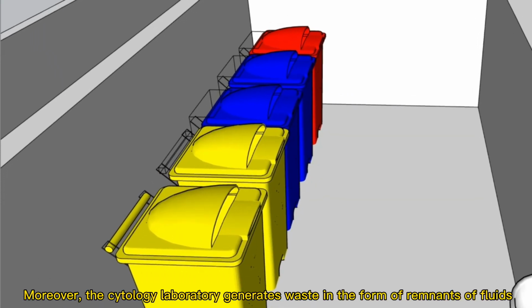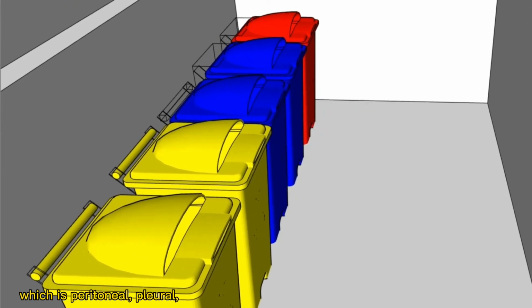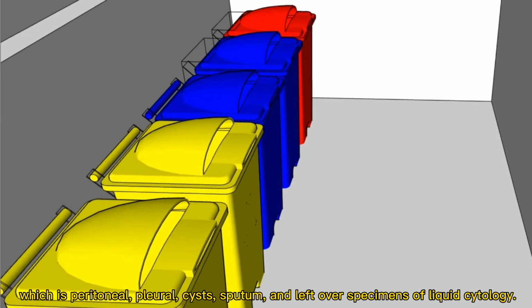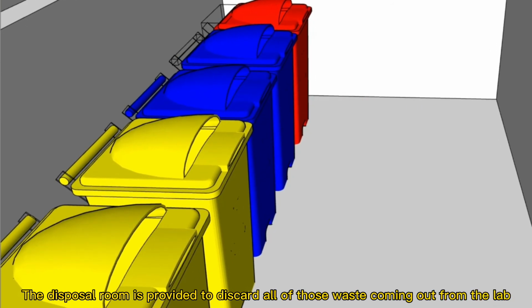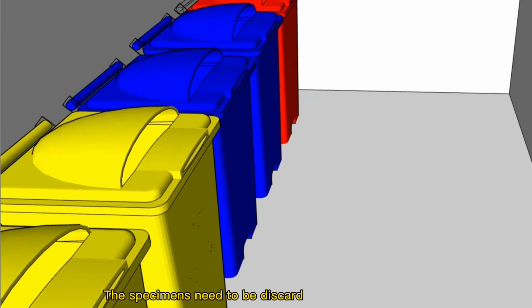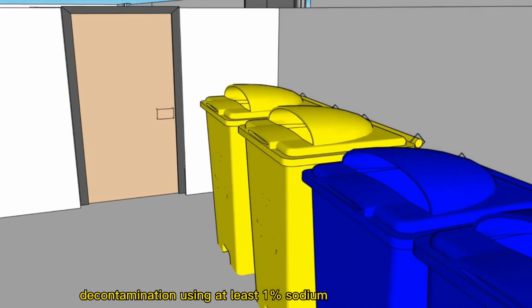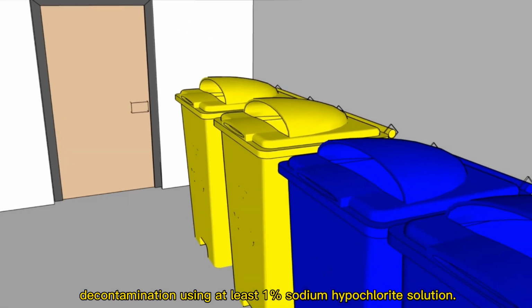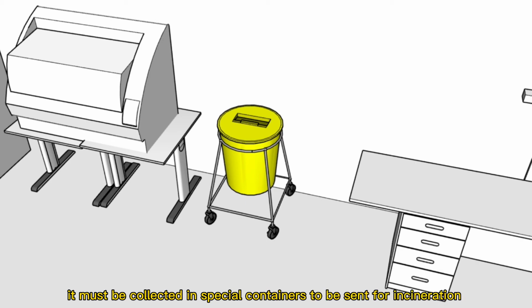Moreover, the cytology laboratory generates waste in the form of remnants of fluid, which is peritoneal, pleural, cyst, sputum, and leftover specimens of liquid cytology. The disposal room is provided to discard all of that waste coming out from the lab. The specimen needs to be discarded only after chemical decontamination using at least 1% sodium hypochlorite solution. Sharps contaminated with biologically hazardous material must be collected in a special container to be sent for incineration.